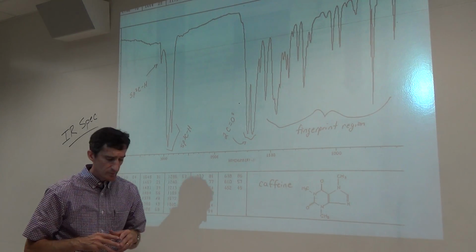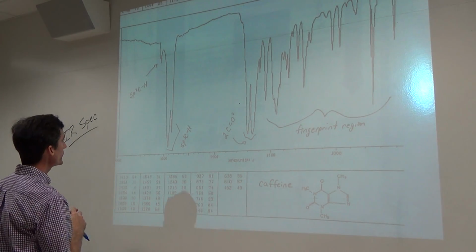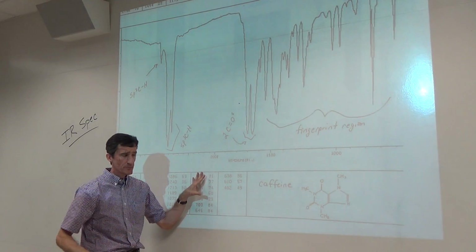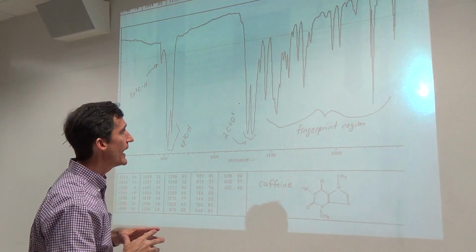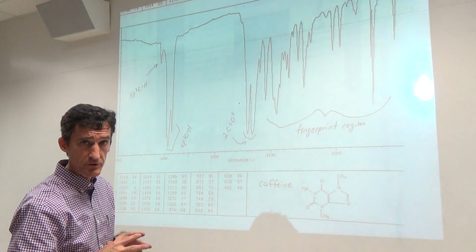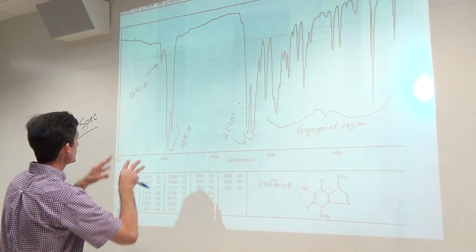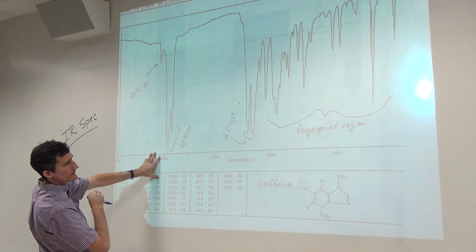Now at this point I'm going to go back to the first page of the handout packet, which has peaks identified for you. In the remainder of the packet, there are a number of IRs, and I will go through them and assign peaks on this video as part 2 of this IR lecture. But here, let's just get you oriented.